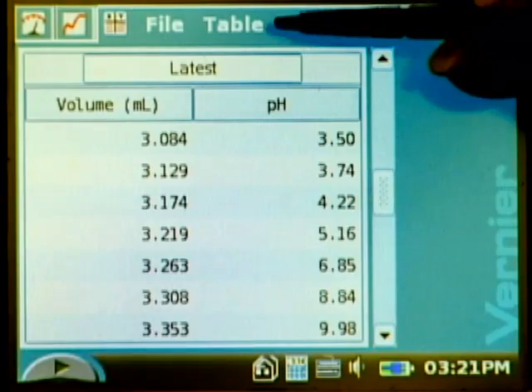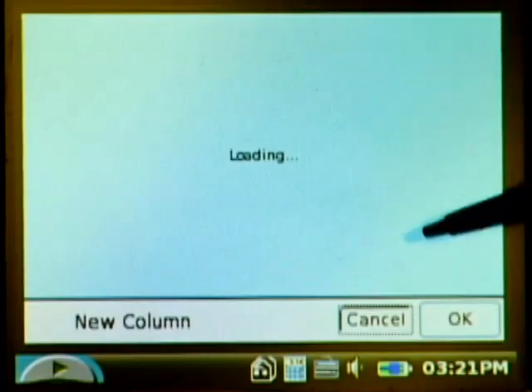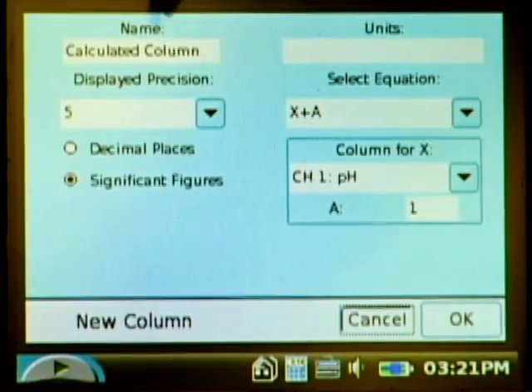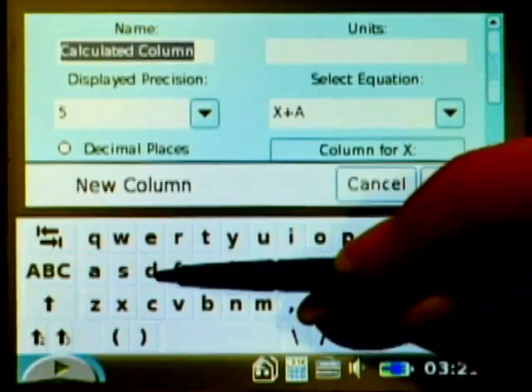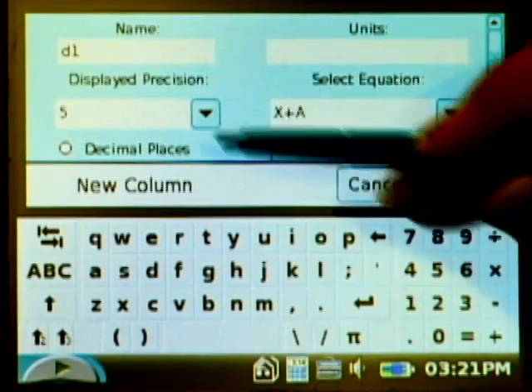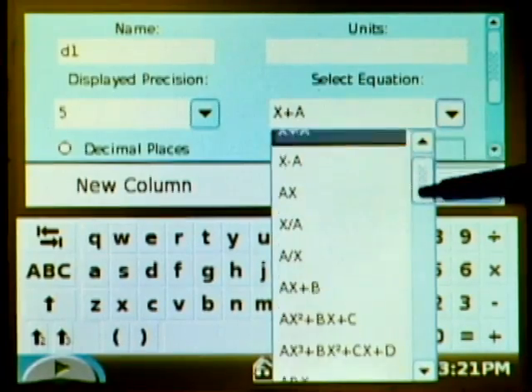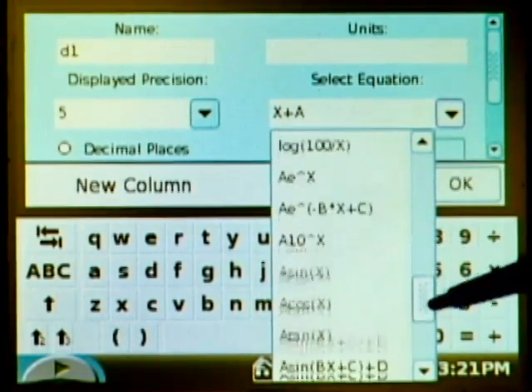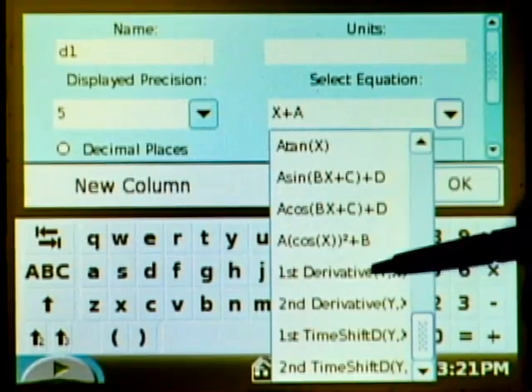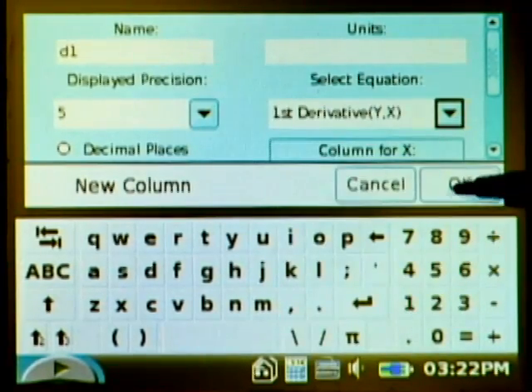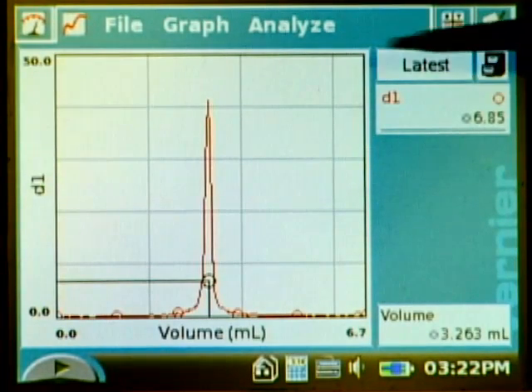One is to create a derivative of our data with a new calculated column. So I'm going to change the name from calculated column just to d1. We're going to do a first derivative here and the equation if I scroll down is already in here as first derivative of y with respect to x and say okay and it automatically then plots that for us on the graph.